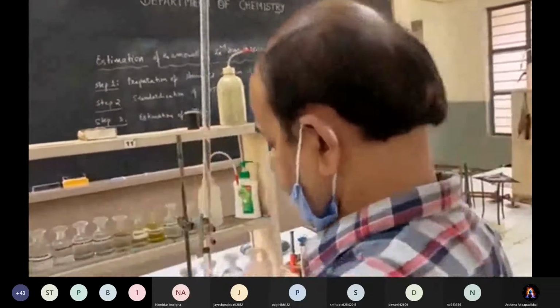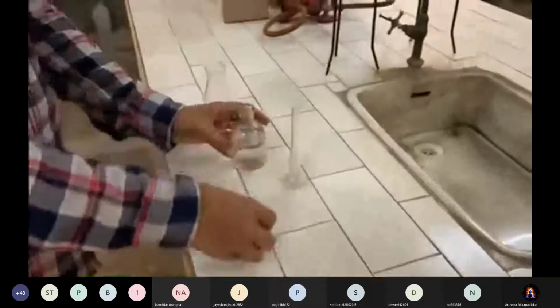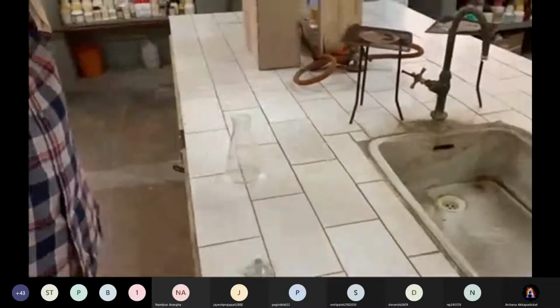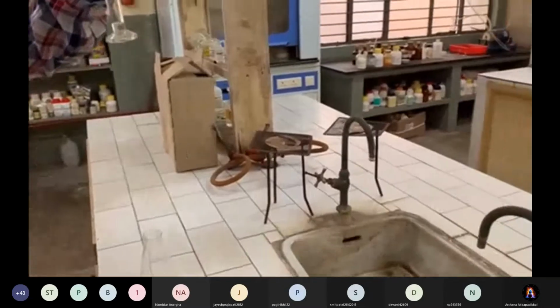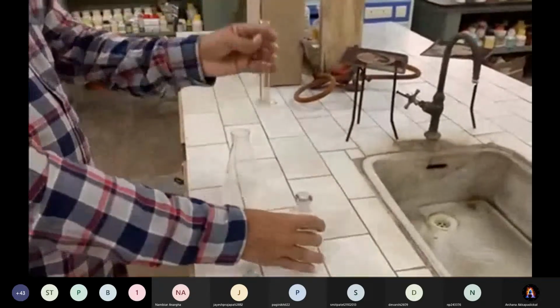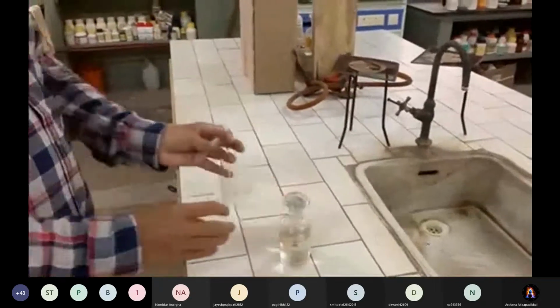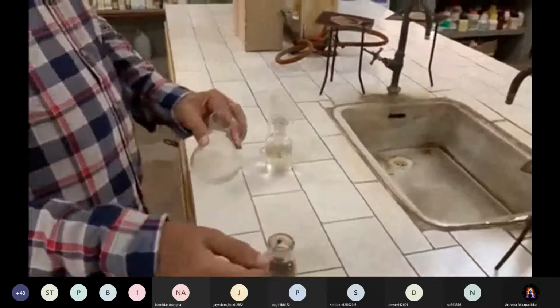So now it is 0. Now to this zinc sulfate solution, in a similar manner to what I did first, I must add roughly around 3 ml of buffer solution. That is prepared by using ammonia and ammonium chloride solutions.